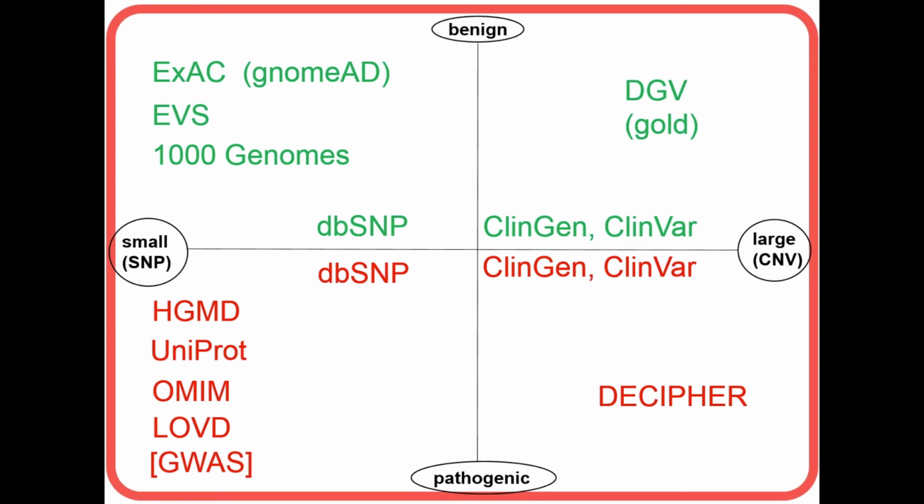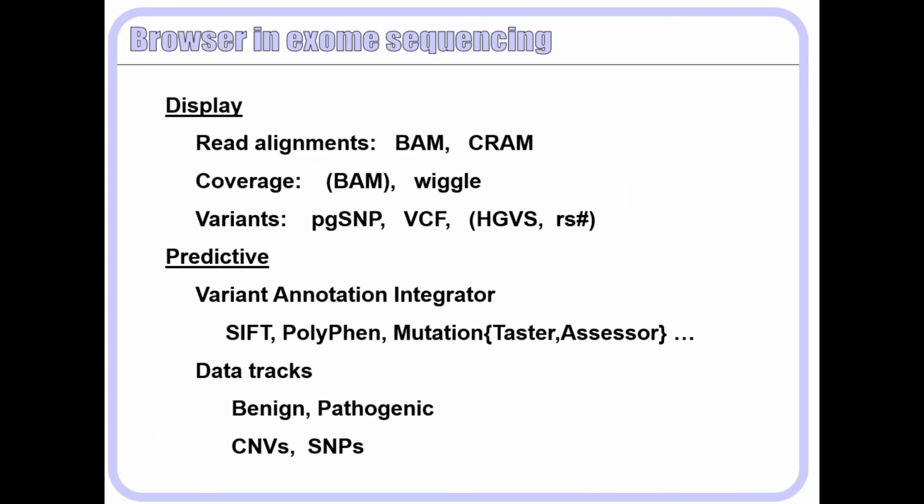in the live portion when I go live to the browser, to show you how you can use sessions to set up scenarios for yourself so that you can quickly get to the tracks you're interested in and not have to reconstruct them laboriously through lots of clicks. And in fact, we have a new feature coming out on the browser fairly soon, engineered by Lou, that will have a number of different scenarios in which you might be interested in having certain data tracks turned on for certain purposes. And we'll be announcing that in the not too distant future.